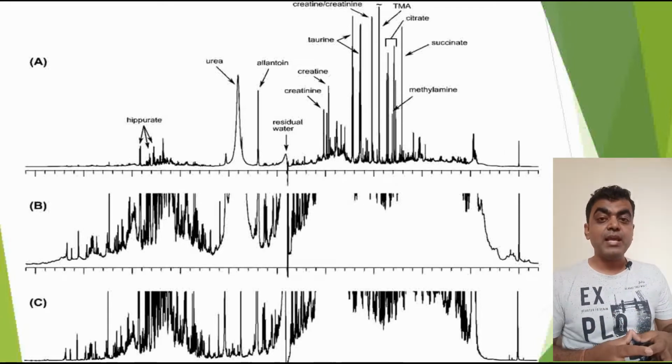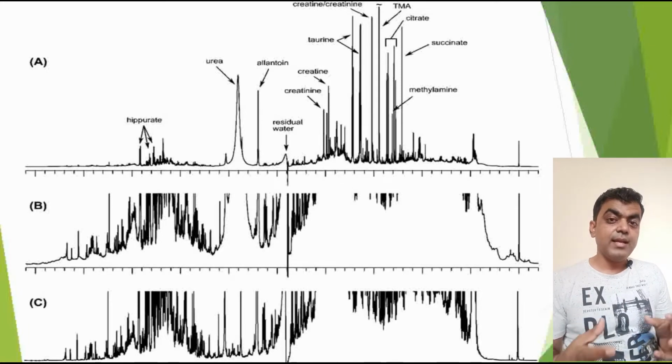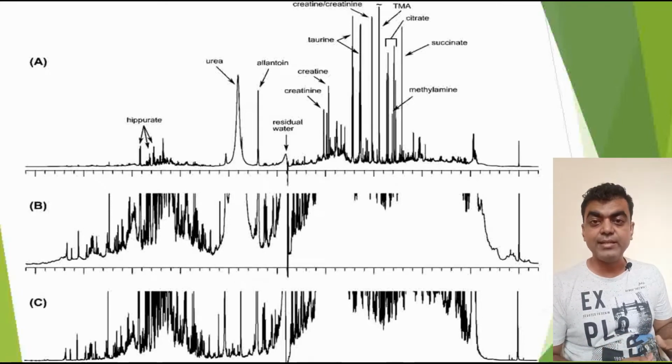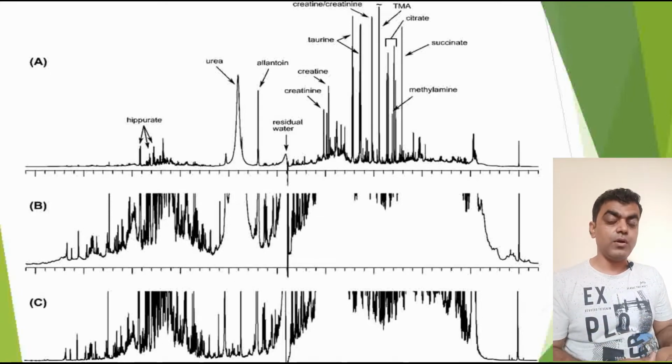Now the problem is, you also have to understand that D2O will dissolve only polar compounds. So if you have something alcohol based, something with OH, something with aldehydes, then they will get dissolved in D2O.